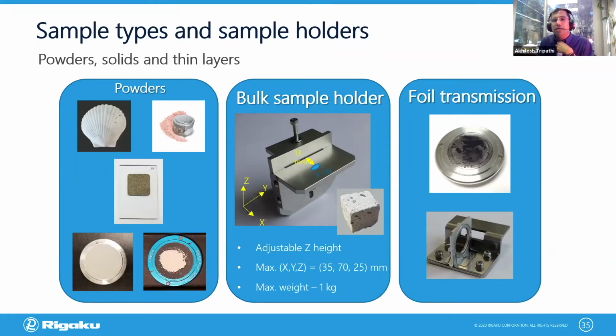And then there are other types of sample holders shown in the third picture, which could be of the type for some liquid, like viscous liquid with particles in it, or a transmission geometry. So depending on the situation in each case, whether it's a ground sample or a bulk or a liquid, different sample holders do exist.